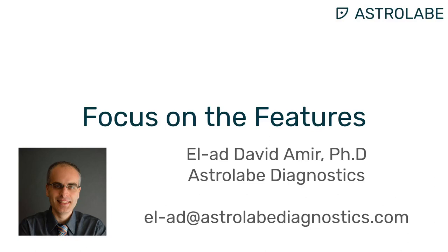In today's video, I really want to focus on the idea that when you analyze your flow or mass cytometry data, or any single cell data to be honest, you should really focus on your feature generation. And I would argue that this is the most important step, that is taking the single cell data and converting it into meaningful features, and a common example is cell subsets or clusters.